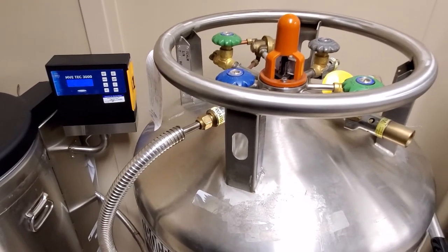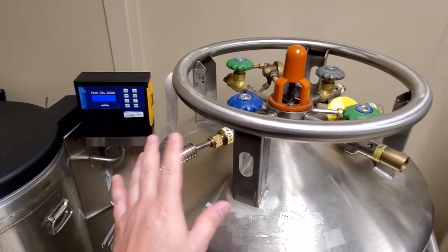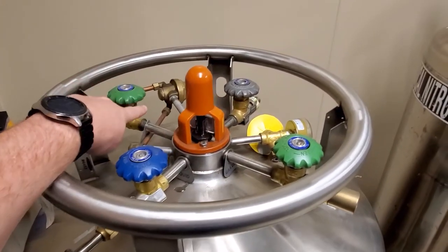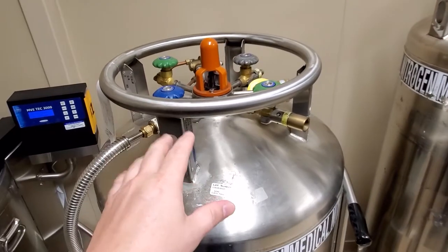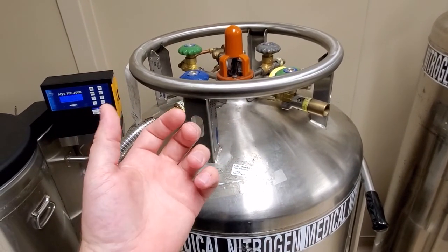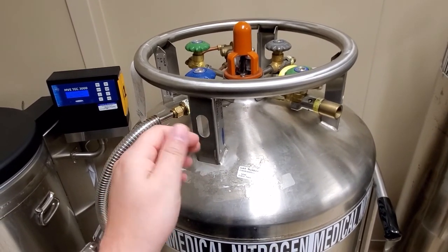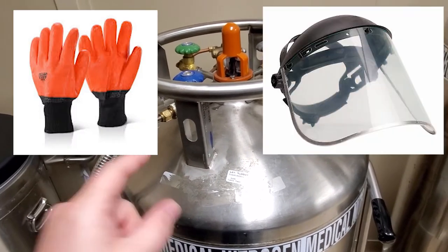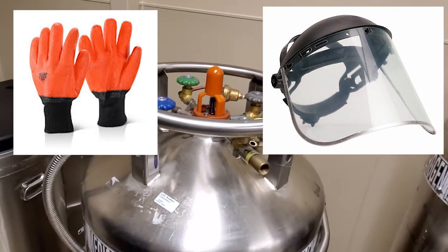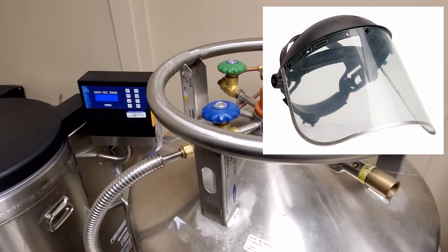Liquid nitrogen is extremely dangerous. It will cause instant hypothermia and tissue damage. If you touch this hose or the recirculation hose while it's cold, it will instantly adhere your skin to the tube because it's so cold. Do not touch these hoses, and use proper PPE. Proper PPE is going to be ultra low gloves and a face shield.